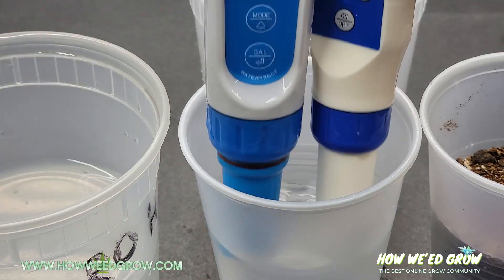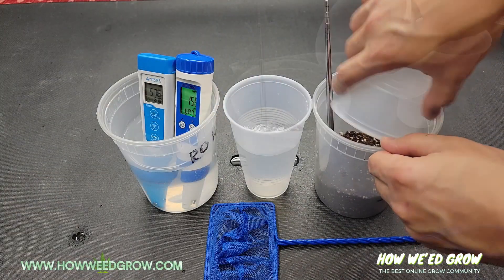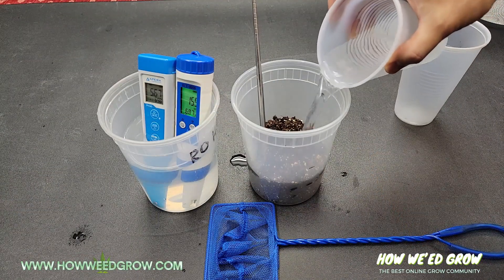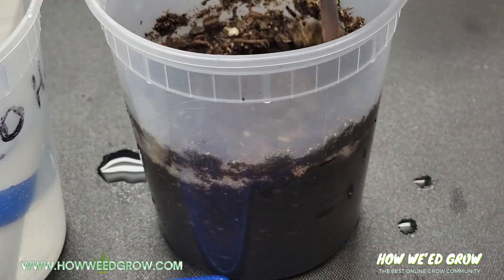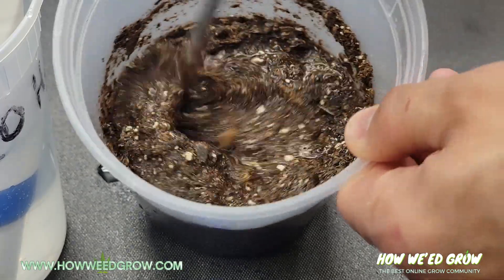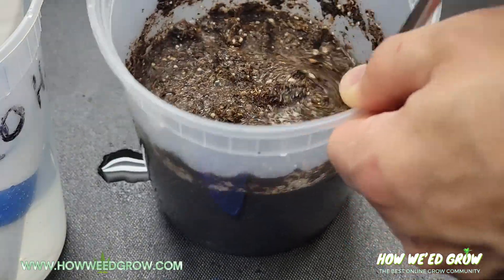After you've recorded your initial pH and PPM, pour the water, then equal parts of soil in volume, to your mixing container. Stir it aggressively, and once you don't see any dry soil anywhere in the mix, leave it alone for 24 hours.